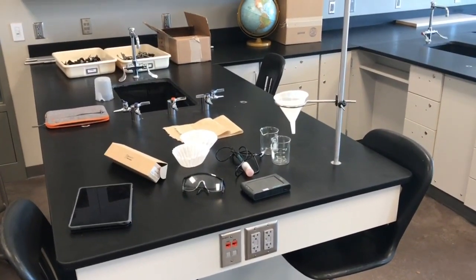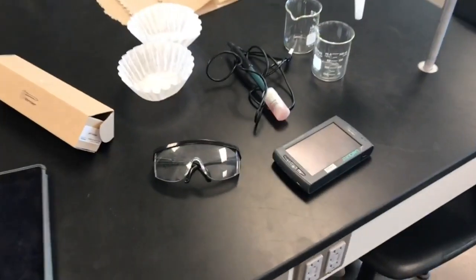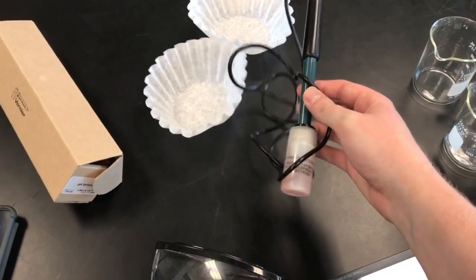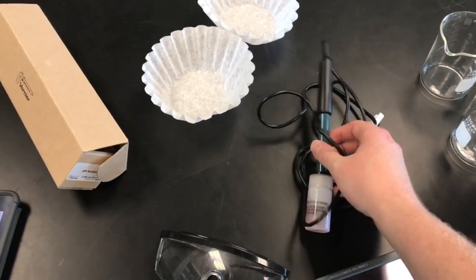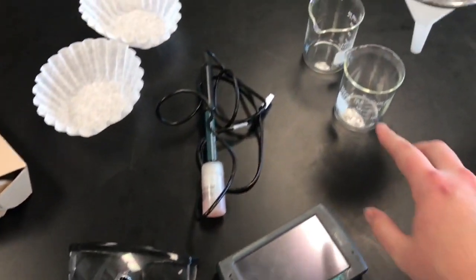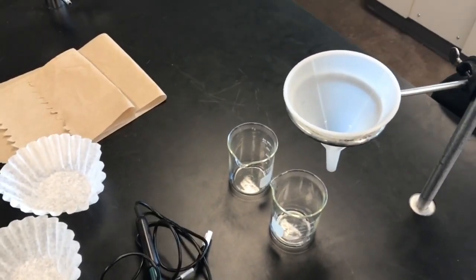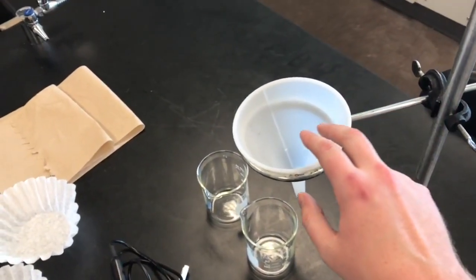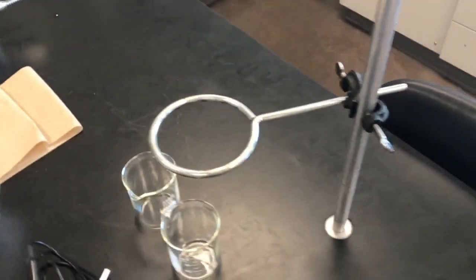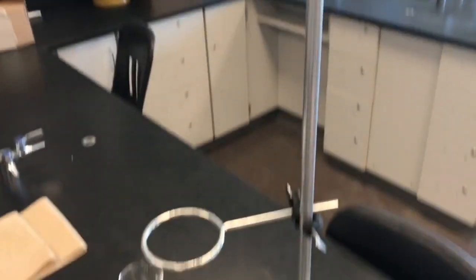All right, so this lab has quite a few materials. For initial materials, what you're going to want to grab is a LabQuest. Attached to your LabQuest is going to be this pH storage solution, pH sensor device that we're going to hook up eventually to our LabQuest. You're going to need two 250 milliliter or 400 milliliter beakers, a funnel, and then attached to that you're going to need a ring stand attached to a pole setup.